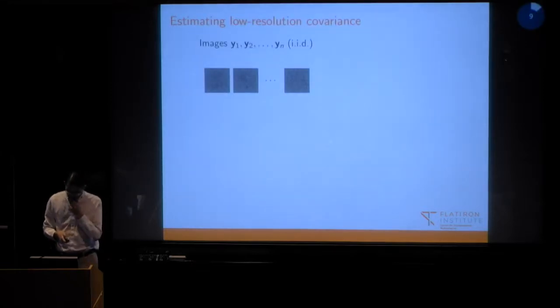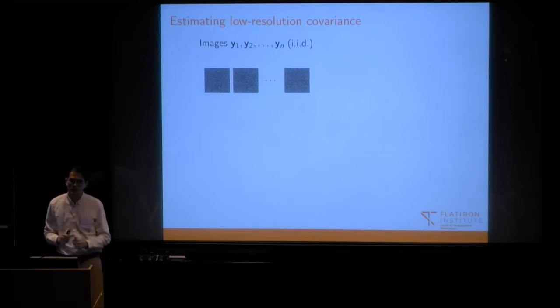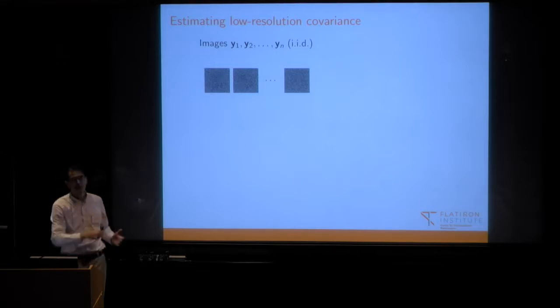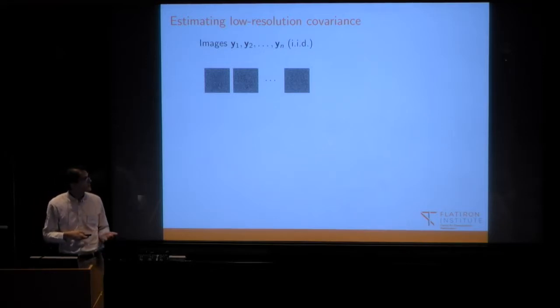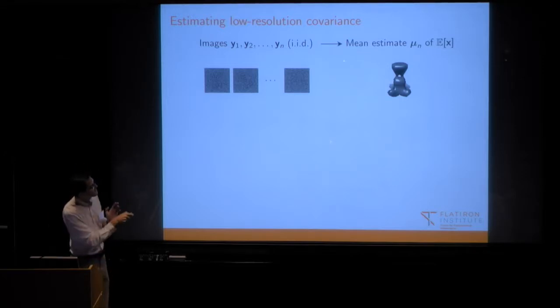All right. So the way we're going to do this is by going to very low resolution and seeing what we can do there. And by very low resolution, I mean taking these images and binning them to something like 16 by 16 images. There's a reason, and we'll get to why we do this, but the first thing that we can do with this is construct a mean volume. And this looks pretty bad, right? This is not something that you can say a lot about.